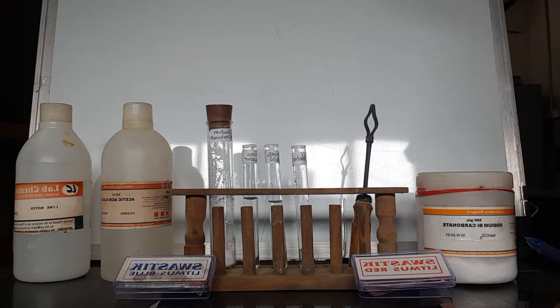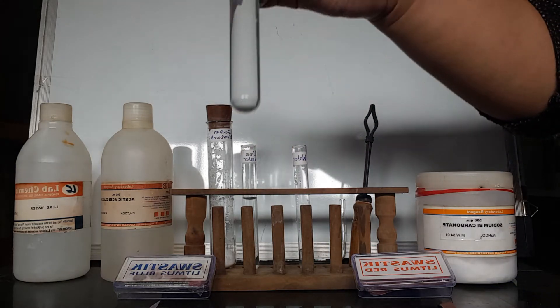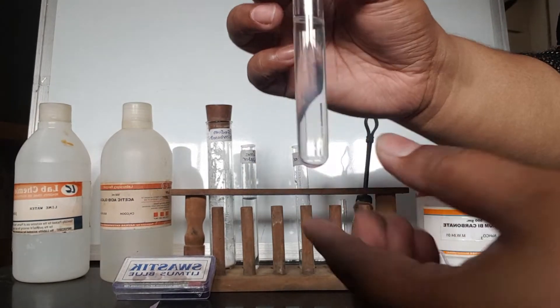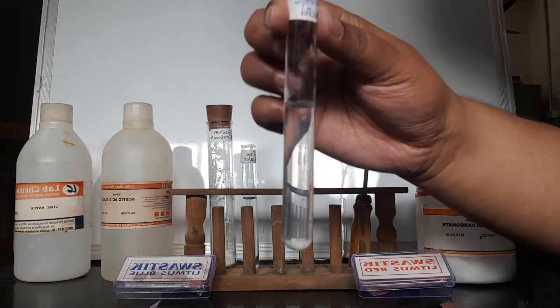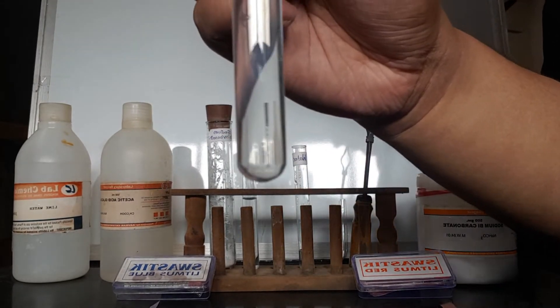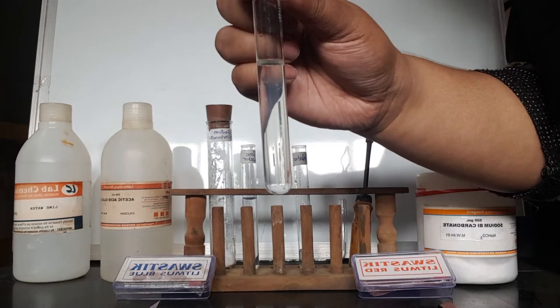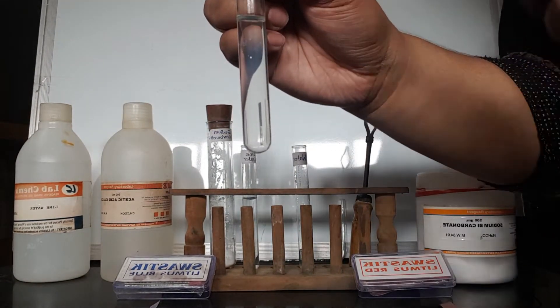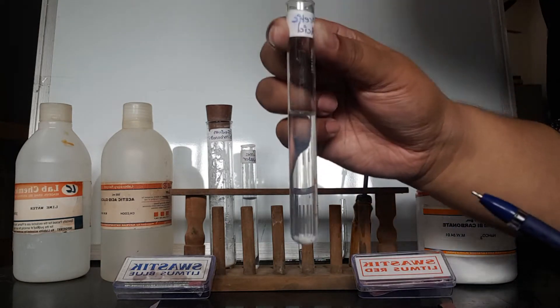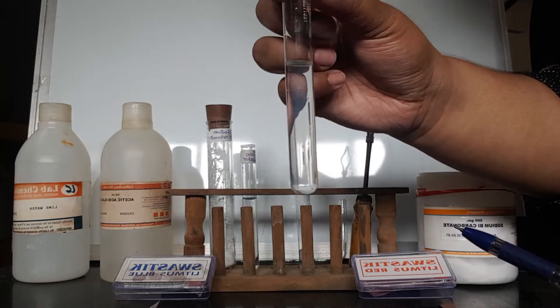First of all, we need to take 2 to 3 ml of acetic acid. We check the color and odor of acetic acid. This solution is colorless, so acetic acid is colorless. The odor of acetic acid is like vinegar — it has a pungent, vinegar-like smell.